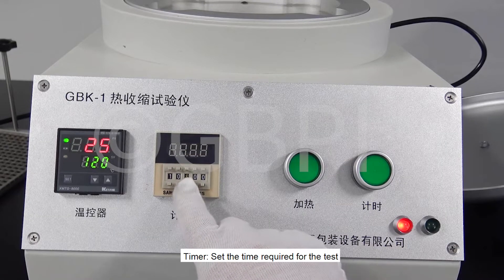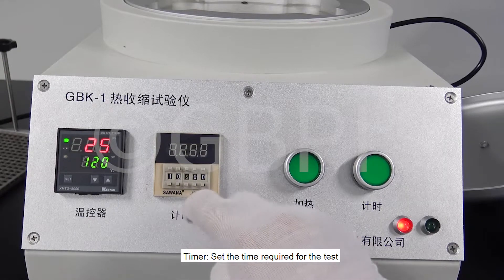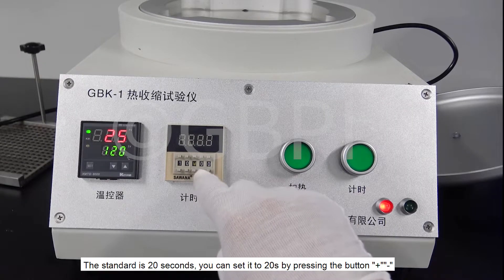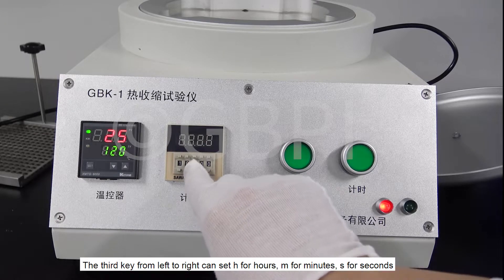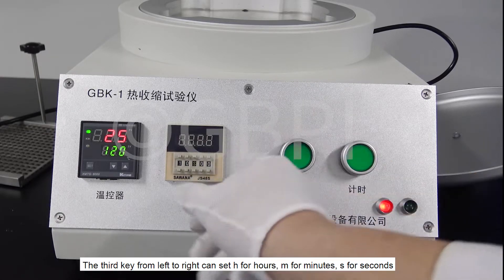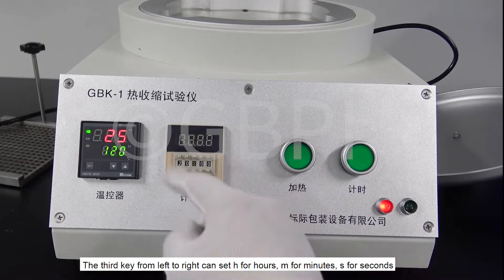Set the time required for the test. The standard is 20 seconds; set to 20 seconds using the add or subtract buttons. The third key from left to right can set H for hours, M for minutes, and S for seconds.